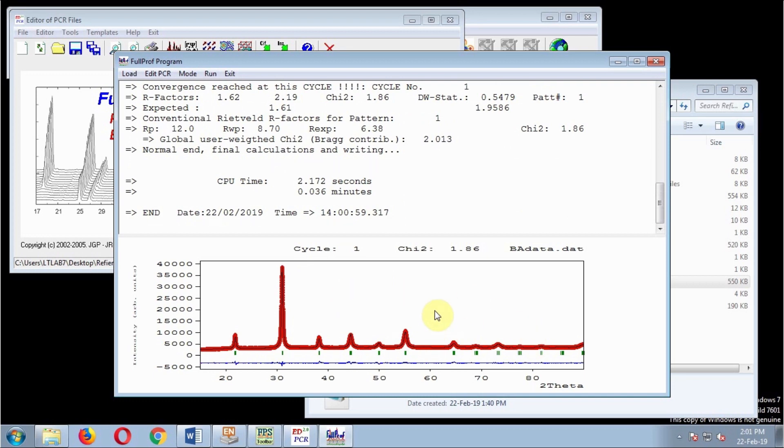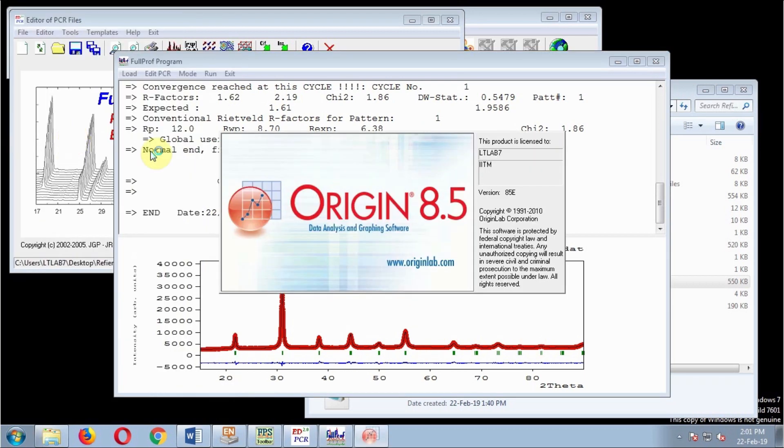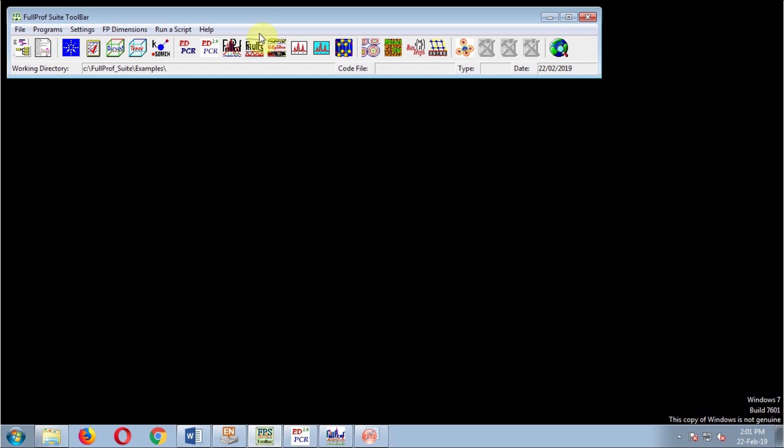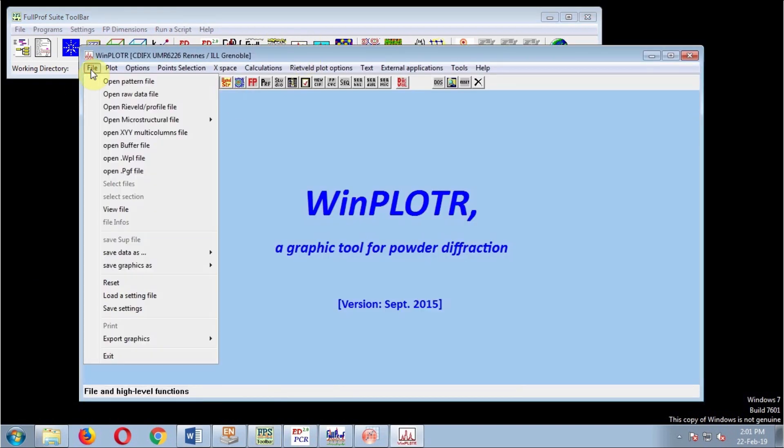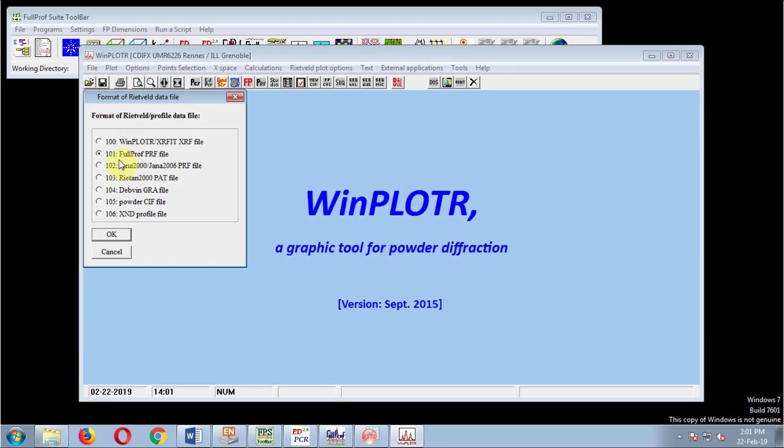I want to plot this in Origin. To do that, I have to open it in WinPlotr. Then go to File, click Rietveld Profile File, which is the PRF file.